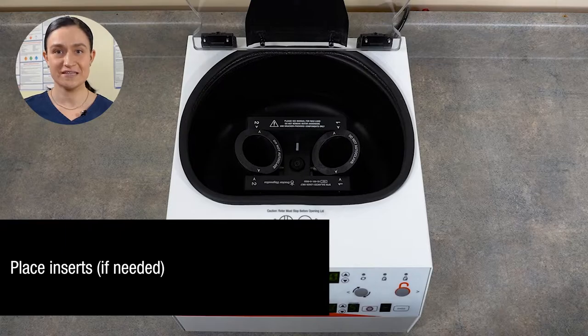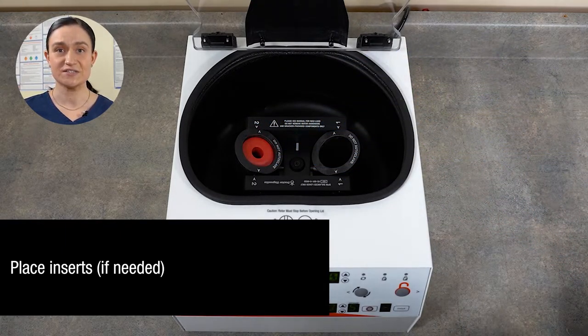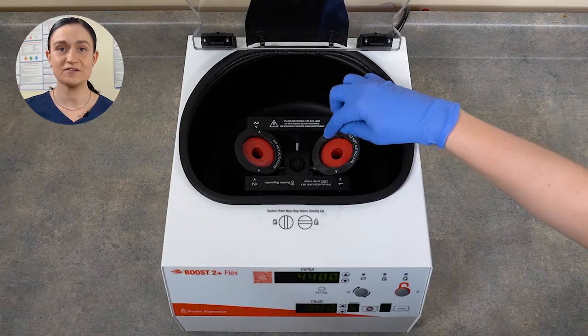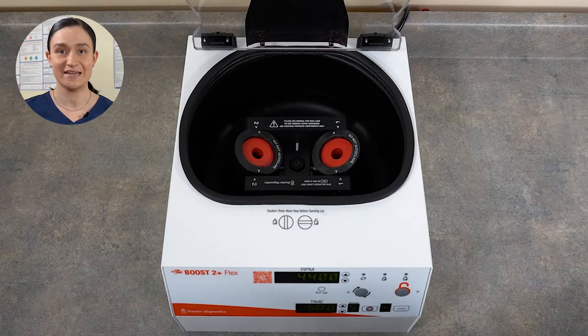Step two: place inserts if needed to spin a smaller tube. If using inserts, they must match. The insert in one bucket must be the same dimensions as the insert in the second bucket.